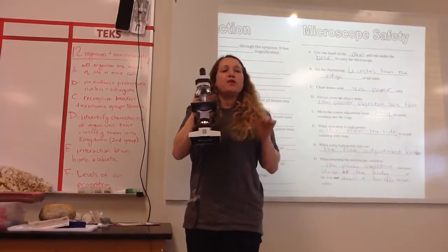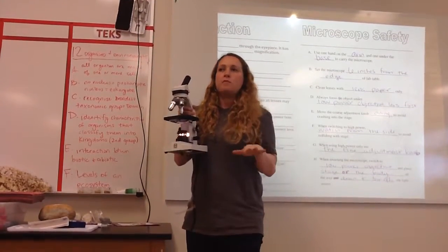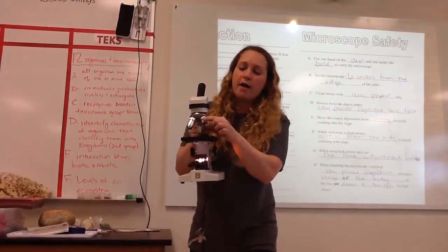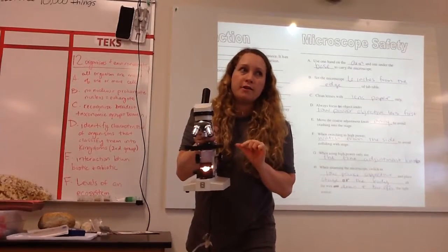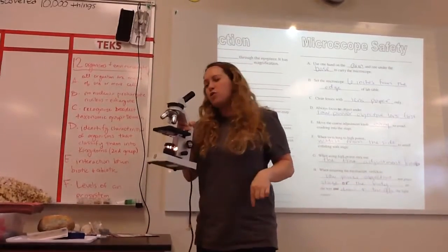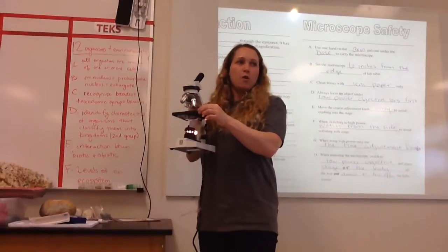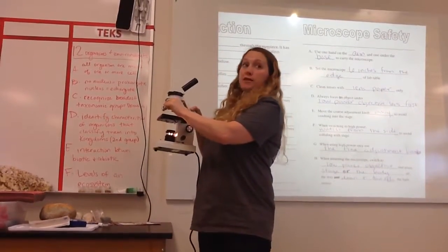When you swivel it, you need to make sure you hear that little click. Did y'all hear that click? Mm-hmm. So I want everyone to be quiet so maybe, just maybe, the video can hear the click. Okay? Are you ready? Real quiet. Can you hear it? Okay. If you don't hear that click, that means that it's not set on either one. Then when you go to look, you'll see blackness because the light can't pass through. So if you ever look in and you can't see, something is blocking it. This is one of the things it could be.